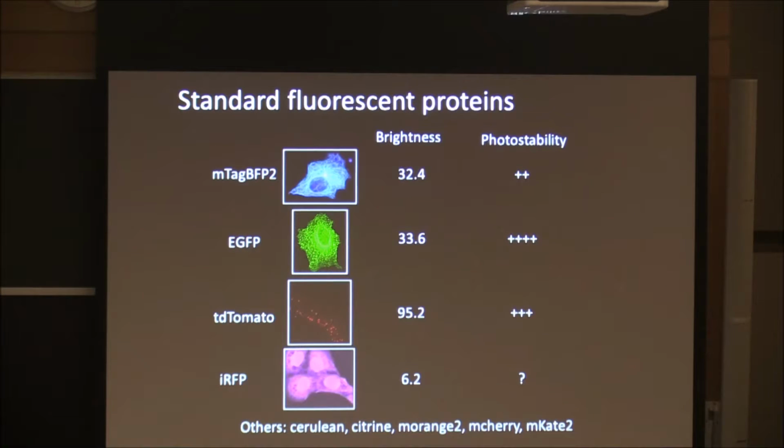And others. So what are the best fluorescent proteins out there? We've had a lot of people that have been trying to push to 4-color fluorescent protein imaging in the facility recently. We've tested out a whole bunch of different proteins, and this seems to be sort of the best complement right now that we found that works with most of our microscopes and still gives decent signal in all 4 channels.